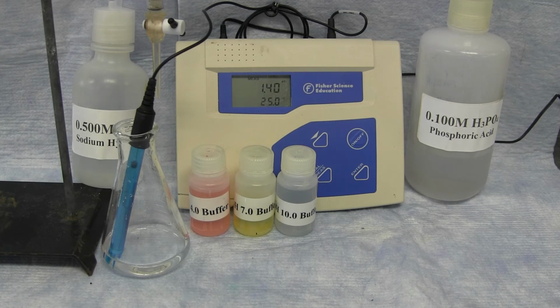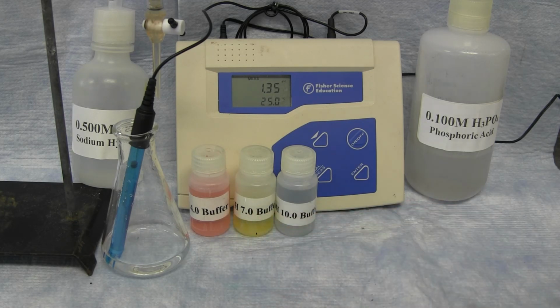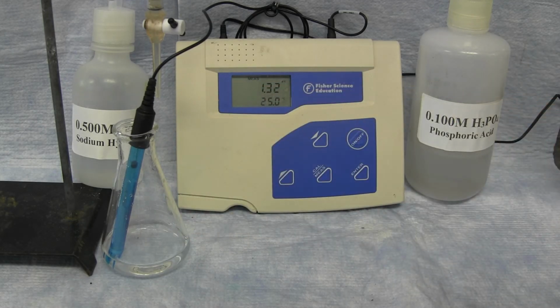When you're measuring using the pH meter, you should always make sure that it has been calibrated since you plugged it in. If you're just starting to use the pH meter, you will need to go through the calibration procedure before you begin the measurements. Once the calibration of the pH meter is complete, you can then record the pH of the phosphoric acid.